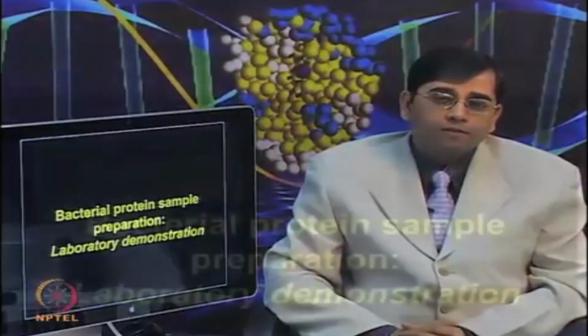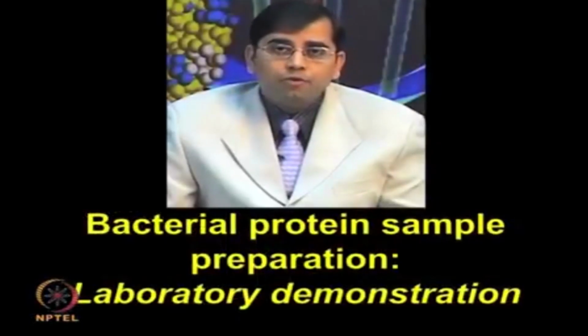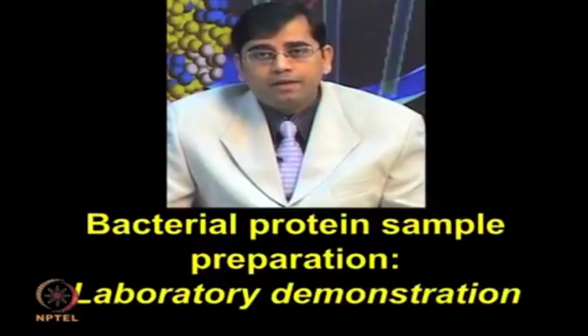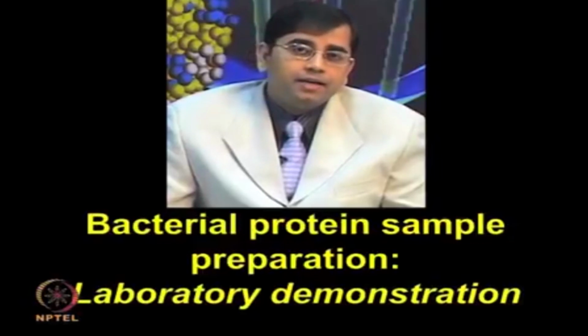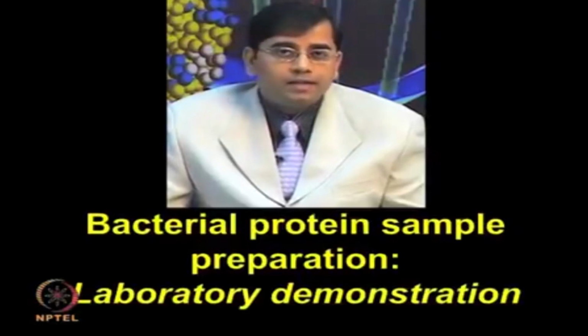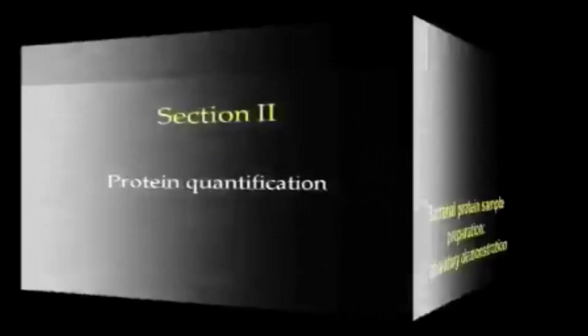Okay, so I hope this video was informative and now you are able to appreciate the complexity involved in this procedure, as well as how useful this method can be for different types of biomolecule extraction including DNA and RNA, and how protein can be rid of various types of contaminants by using the TRIzol method.